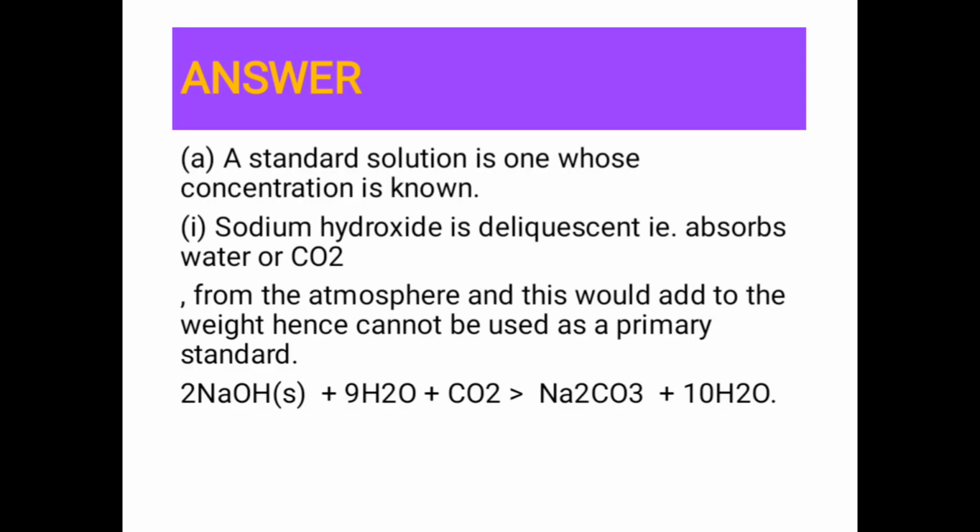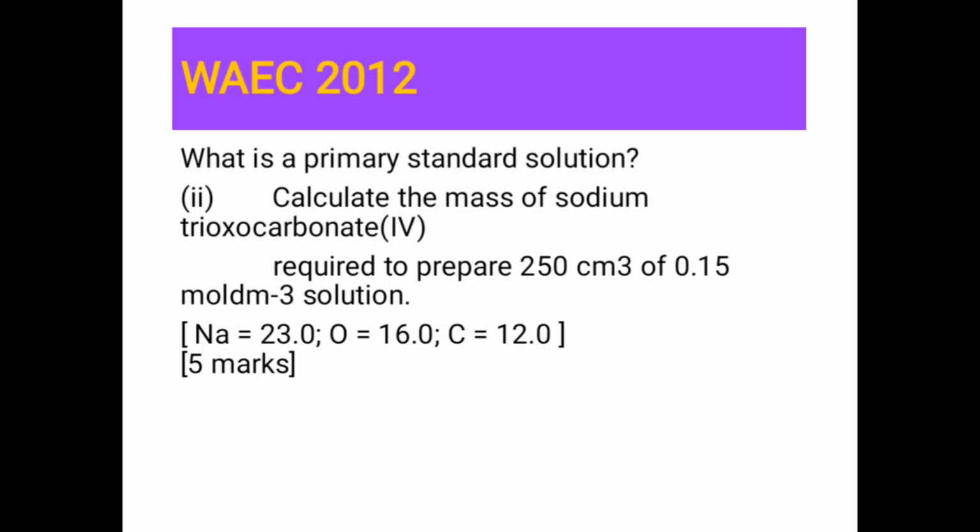What we are trying to say is that sodium hydroxide cannot be used as a primary standard, because it is deliquescent. It will accept moisture. If you expose it for a very long time, it will accept moisture or CO2 and dissolve in it, and this will generally add to the weight. That means the weight is not in its original form again. The weight has been tampered with, so we cannot use sodium hydroxide as a primary standard. That's the answer for that question.